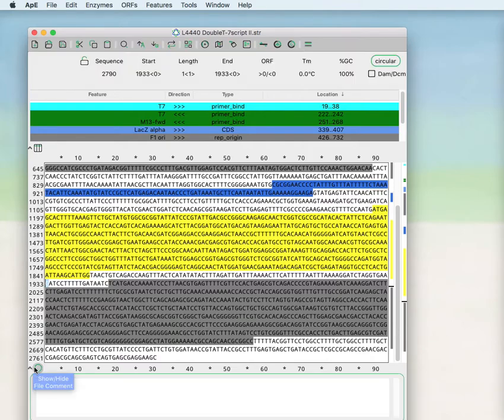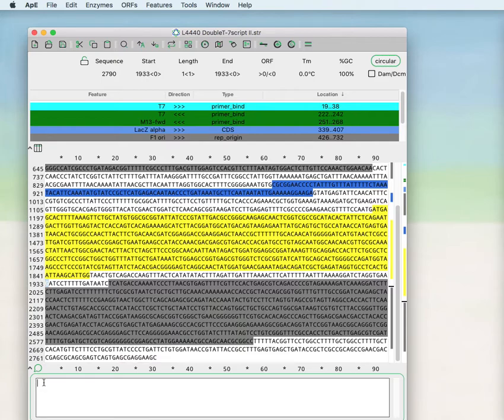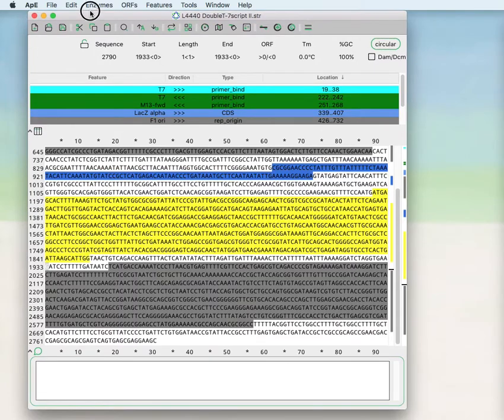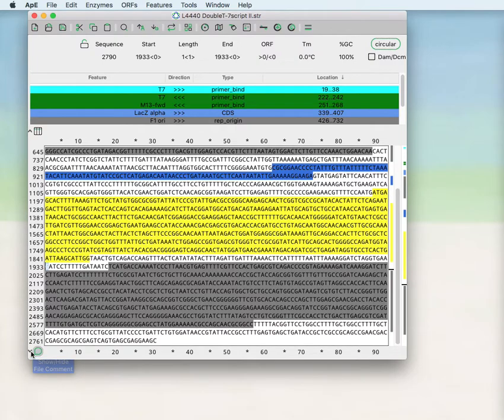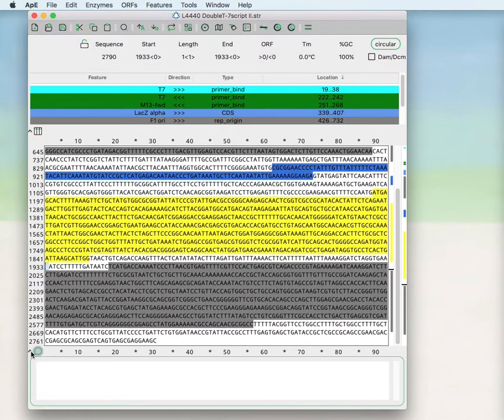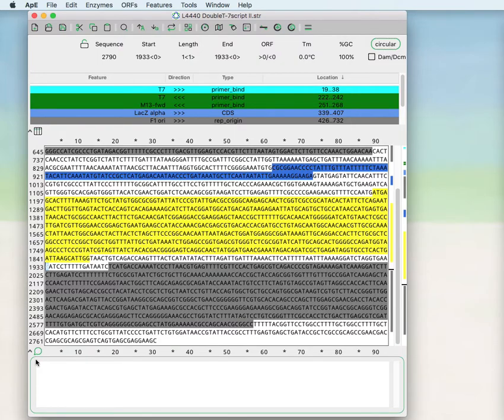There is a comment box here that can be typed into to save information about the current feature file, the current DNA file. You can hide that by clicking here. You can also make it larger by dragging here.